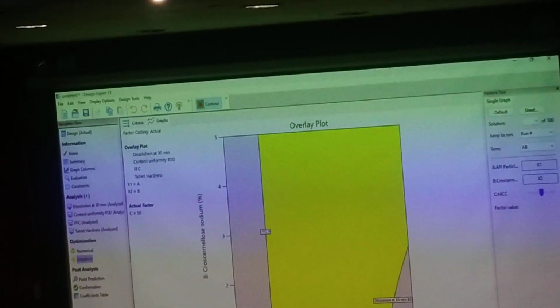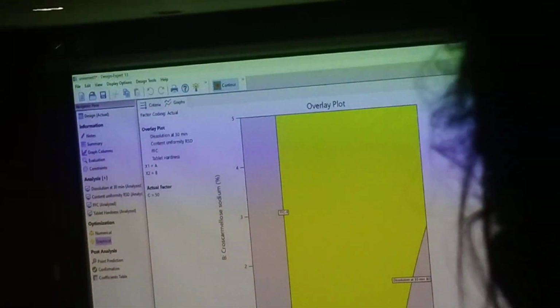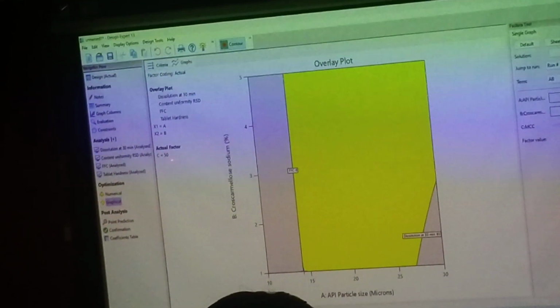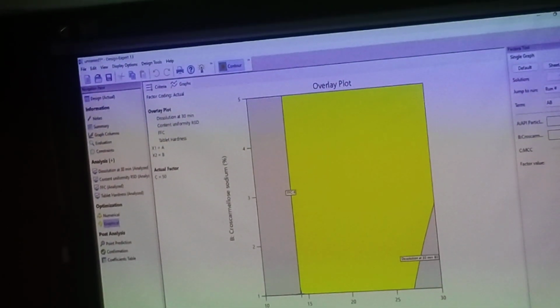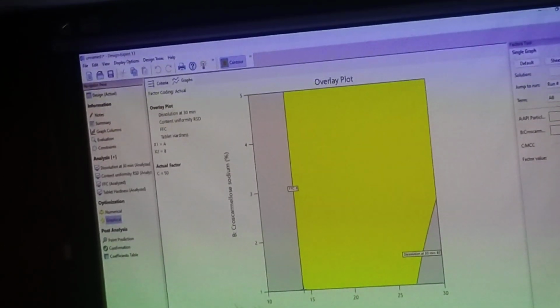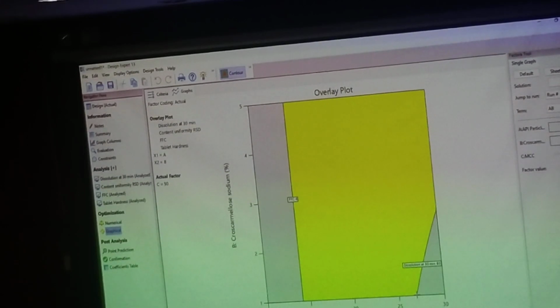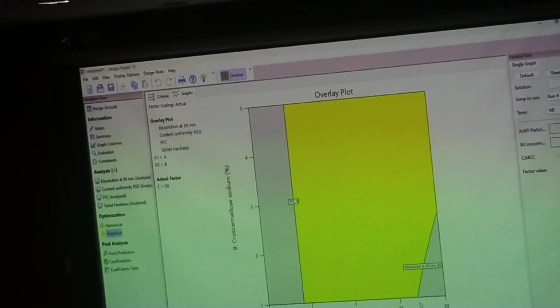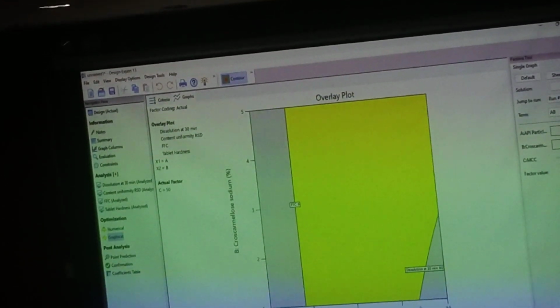And then at this point, x1, that is API particle size, is opening at 14, disintegrant is 1.01, and MCC is 50. So you can start from 14 microns, a particle size. Disintegrant can be 1.01. And you have to draw a straight line here, extrapolate this, and ignore the rest of the part, because down you have a gray area. So this will be your end point.